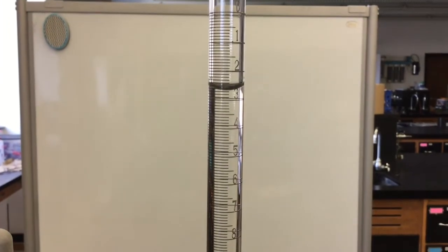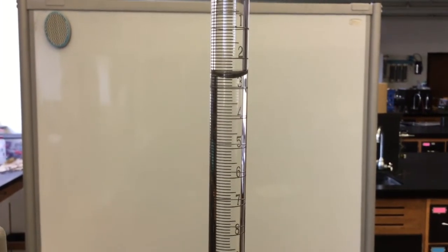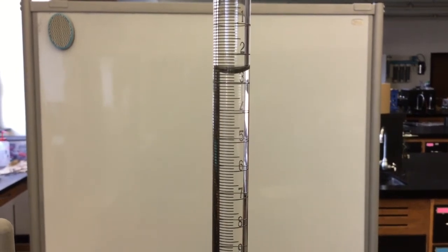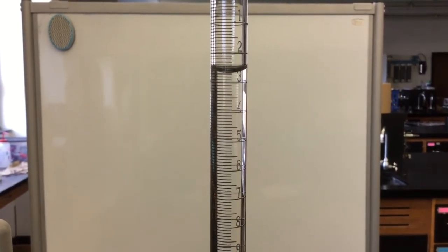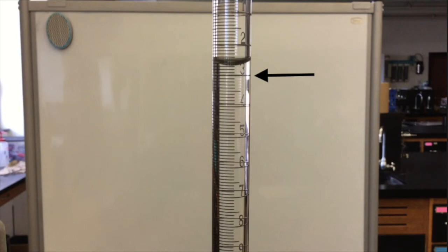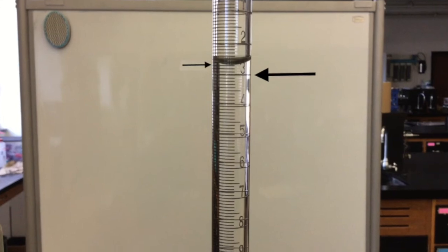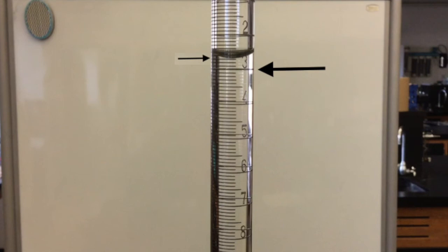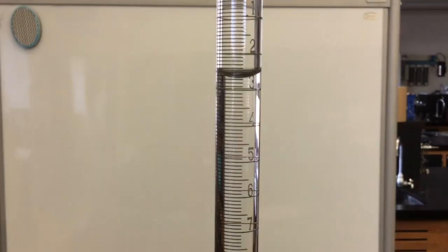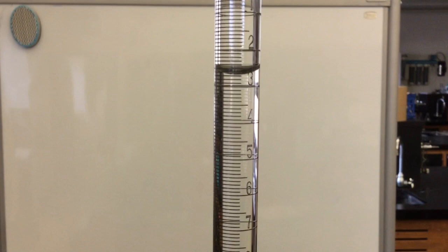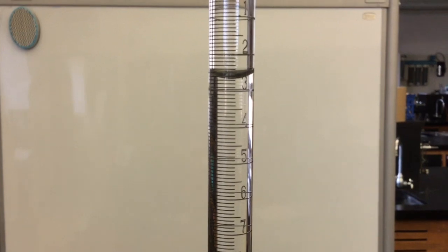I find it helpful to get the lines that go all the way around the burette to overlap with one another to know that I am looking at the measurements straight on. Remember to read at the bottom of the meniscus, and remember that the numbers go from low numbers at the top to high numbers at the bottom. Record the measurement in your lab manual to two decimal places.